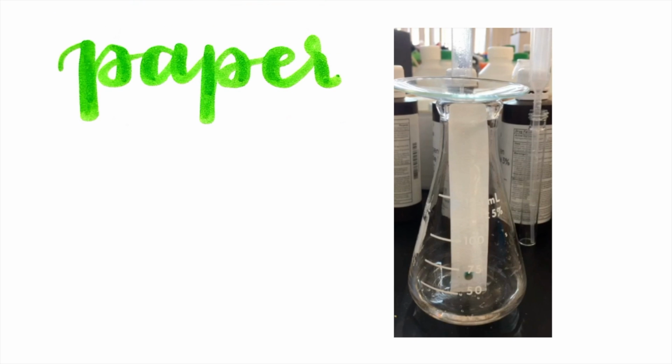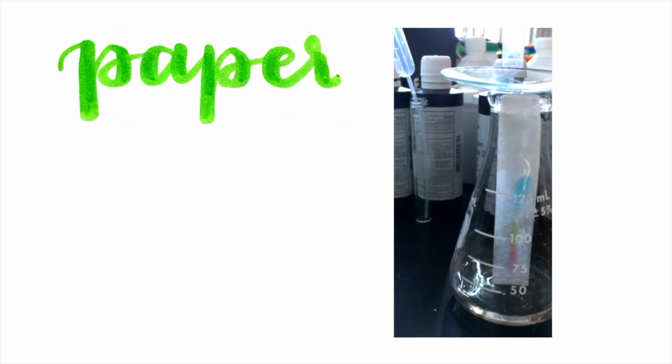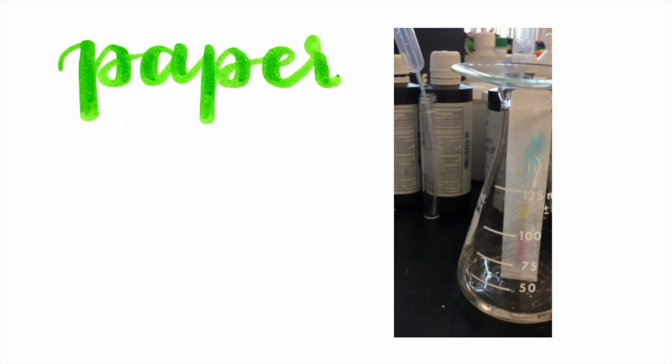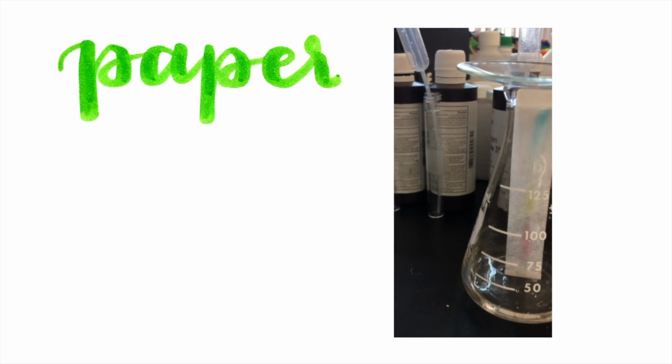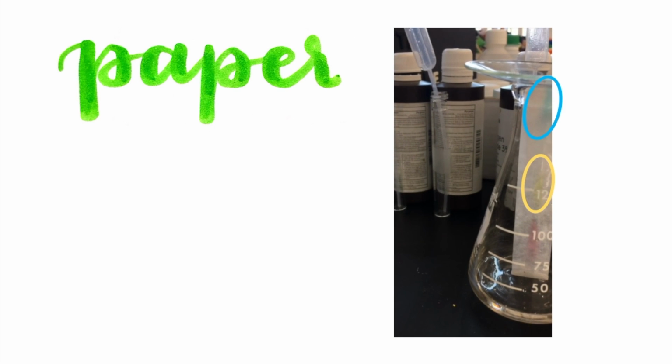In paper chromatography, you take a dye mixture and put it at the bottom of a chromatography strip. This is the stationary phase. Next, you place the paper in a small amount of solvent and allow it to run through the strip using capillary action. This is the mobile phase. The colored solution separates into individual solutes, which are the different dyes that we see here.